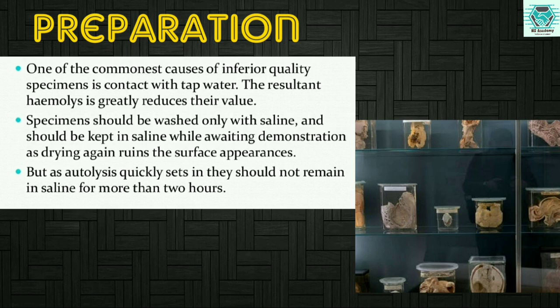In the preparation, the specimen can be obtained from autopsy or directly from the operation theatre. The specimens are first cut according to the need of the museum technique, and they are cut by a brain knife or butcher's knife.